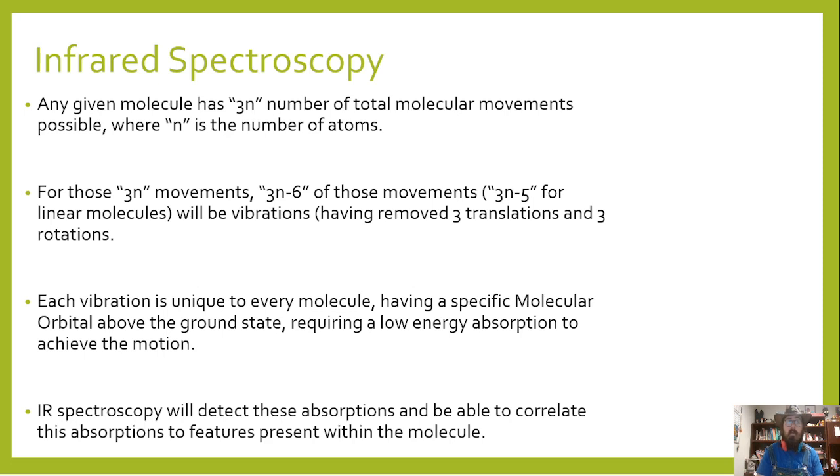Now, each vibration is unique to every molecule. They have a specific molecular orbital above the ground state, requiring a low energy absorption to achieve this. If we talked about the molecular orbitals, there's actually small little movements up and down, like tiny little stair steps that are going to those vibrations.